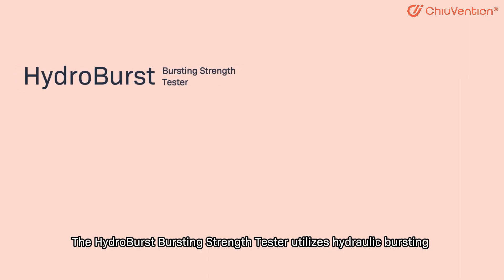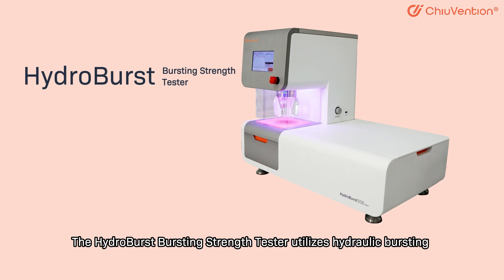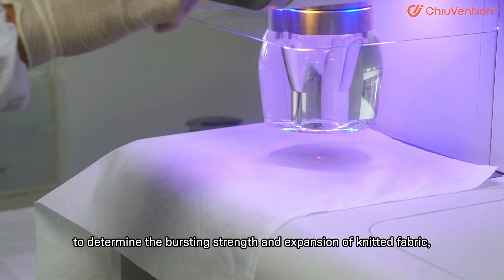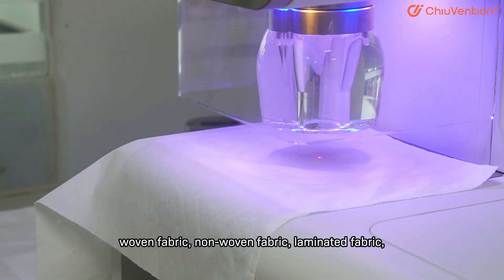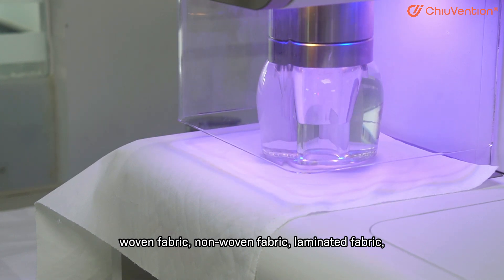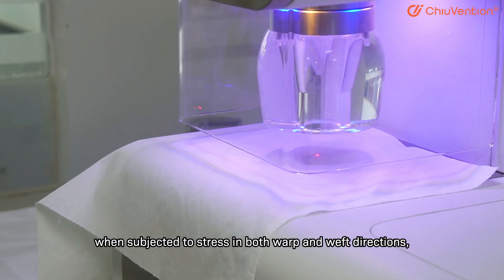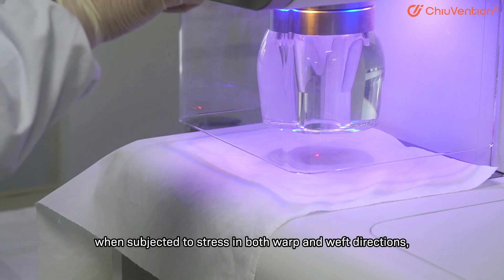The Hydroburst Bursting Strengths Test utilizes hydraulic bursting to determine the bursting strength and expansion of knitted fabric, woven fabric, non-woven fabric, laminated fabric, elastic woven fabric, paper and other materials, when subjected to stress in both warp and weft directions.